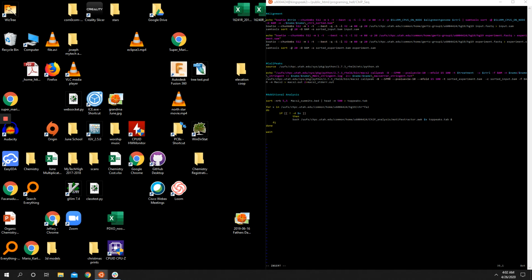Okay, so now that's done. We've got our FASTA file. Now we've got to run our wonderful program called meme on it. And meme is just a program that goes through and looks for enriched motifs. And so, meme, this is the command I've got for it.